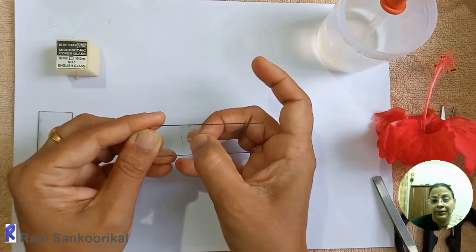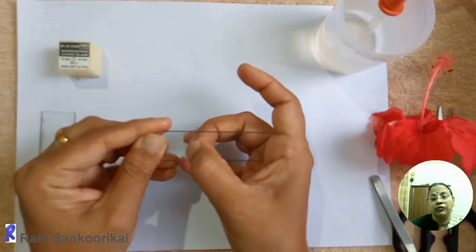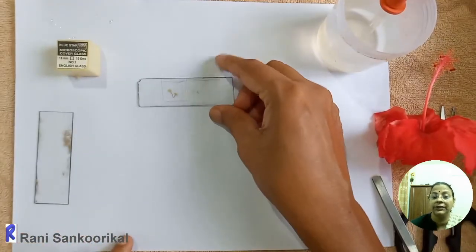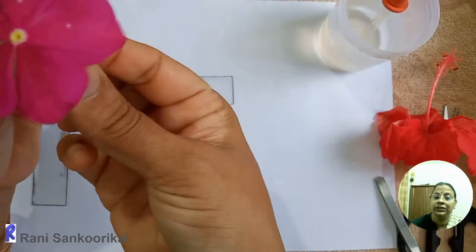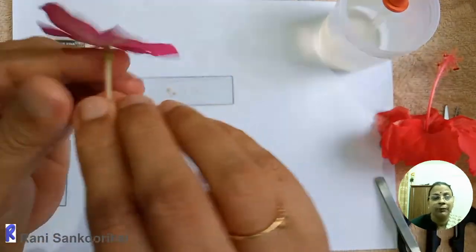So once that anther is completely smashed, then wait for approximately 30 minutes. But before that, it is well and good if you are observing this under the microscope, so you can see the pollen without germination. Okay, then after 30 minutes, you can see the difference between the germinated and non-germinated pollen.